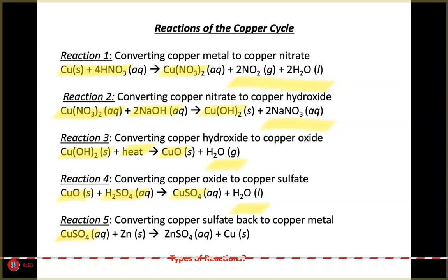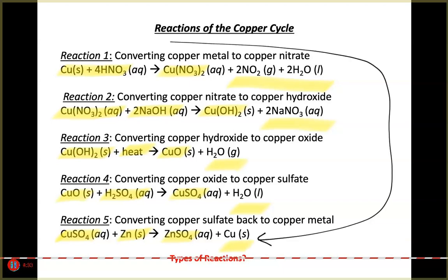Copper sulfate is reacted with zinc to form zinc sulfate, and then we've completed our cycle. What I ended with was copper solid, and copper solid is what I began with. This is the idea of the cycle.